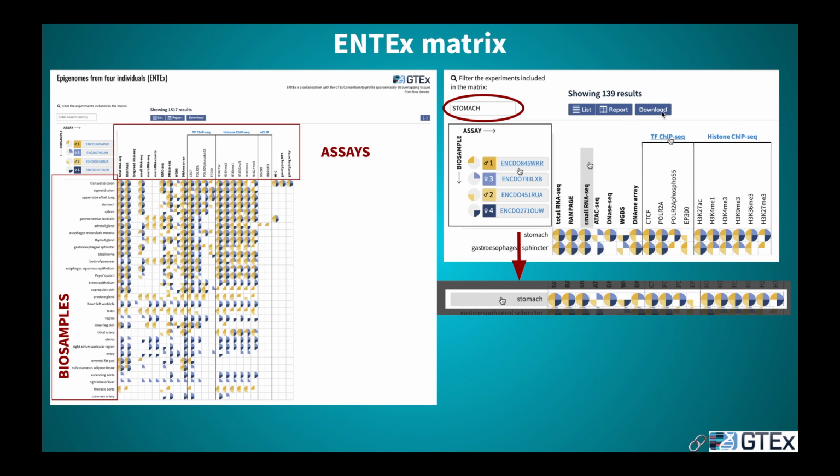If you are not interested in all of the samples and want to further subselect using the assay types, you can click on the several assays that we have. In this case, TF-ChIP-seq also has a special meaning where we have grouped all the different targets that are assayed using the TF-ChIP-seq experiment tag here.